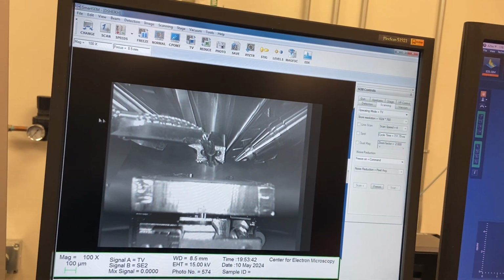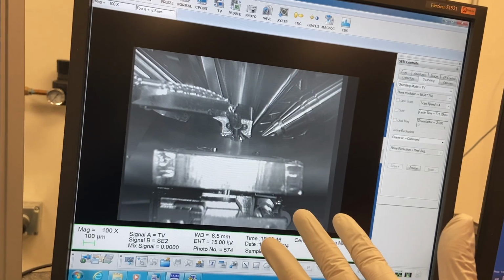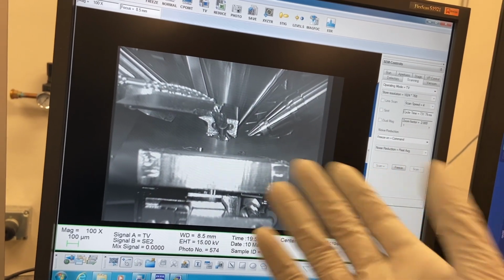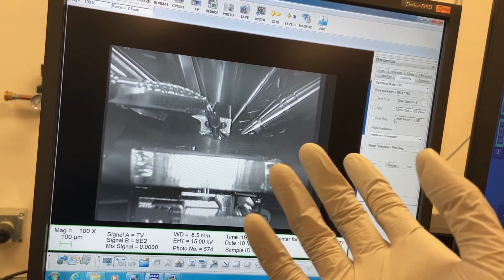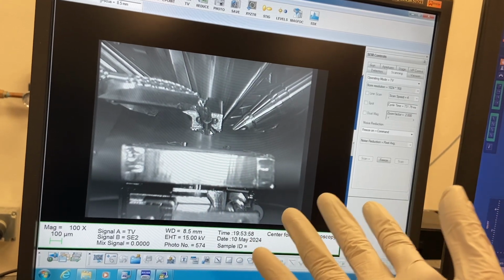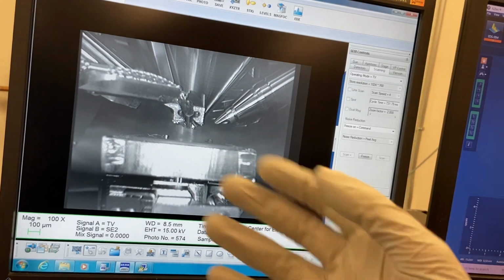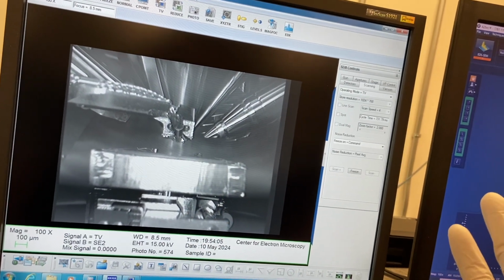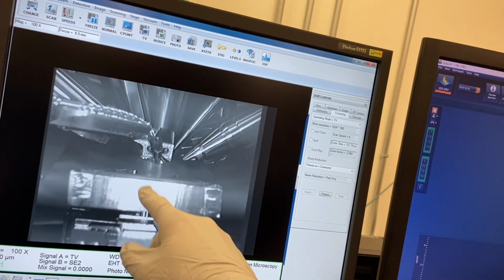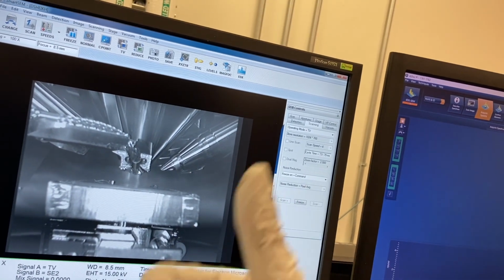And the higher the atomic Z of your sample, so the larger the nucleus, which you get for elements that have relatively large atomic masses on the periodic table, like iron, versus something that's relatively smaller, like sodium, the higher atomic mass nucleus, or the nucleus with more protons and neutrons, so elements that have high Z, we call it Z contrast, they are going to give off more signal, because those electrons that interact are more likely to scatter upwards, so their elastic scattering or backscattering coefficient is higher.